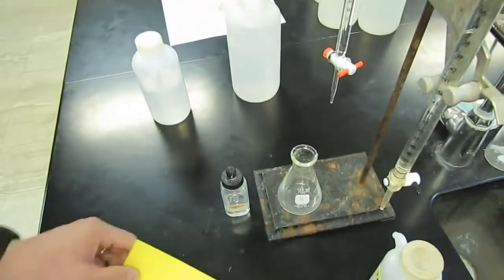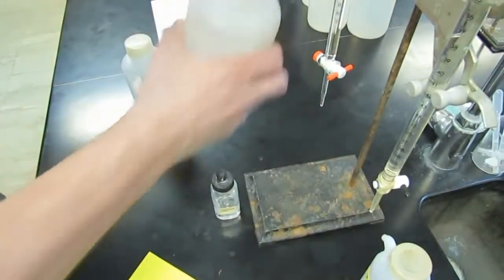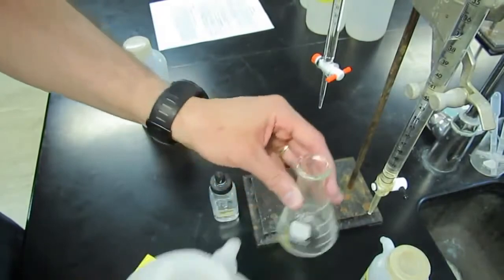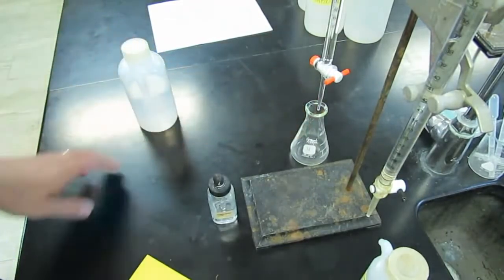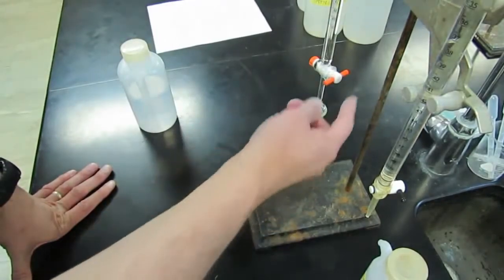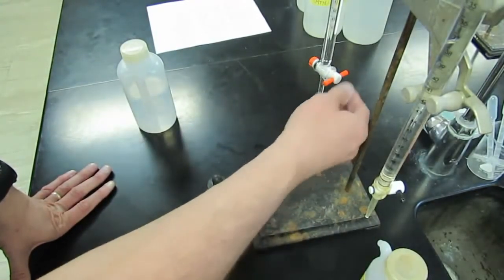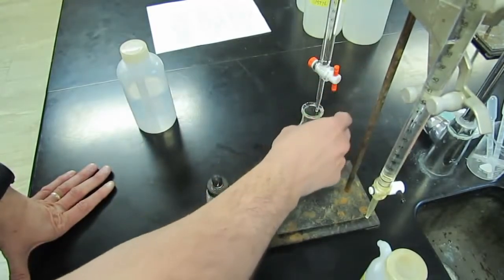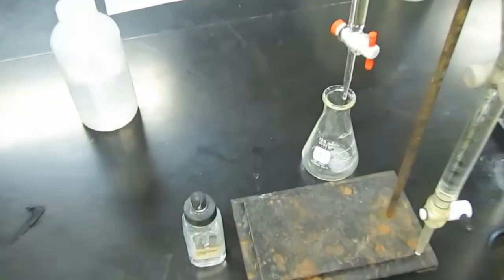Now, we're going to need to put some acid in our flask, and we can rinse this out with distilled water. Doesn't make a difference if it's dry. And we'll put that under the burette for our acid, and we will obtain approximately 25 milliliters. So to open up our stopcock, when it's perpendicular, it's obviously closed, and when it's parallel to the burette, we've opened it up. So right now the acid is entering the flask.